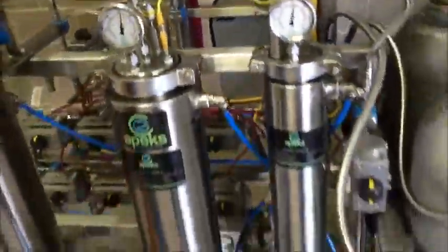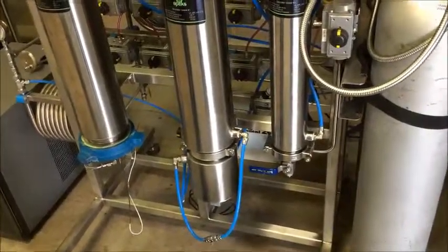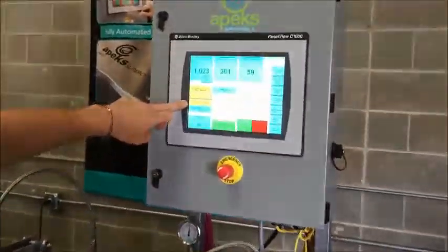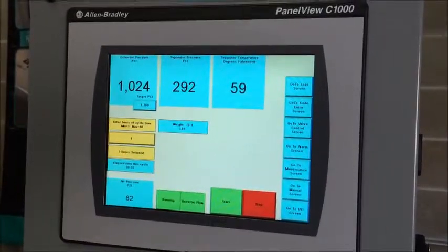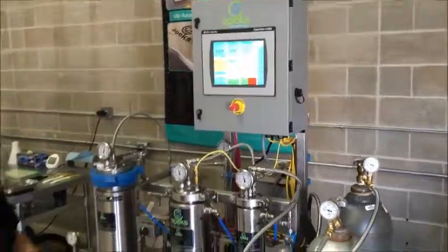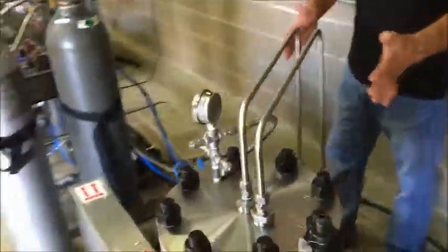As described earlier, we have liquid CO2 — it's liquid at this pressure and temperature in our extractor — and right now it's flowing over our plant material. We're bringing that over here, and our oil is separating out of the CO2 into our collection cup. Now you can walk away and the machine, once it reaches the end of its run time — right now we have an hour selected — will go into recovery mode. At that point it takes about 30 minutes or so to recover all the CO2 back into the CO2 bottle.